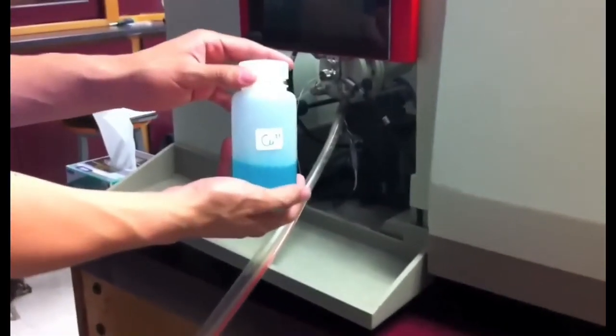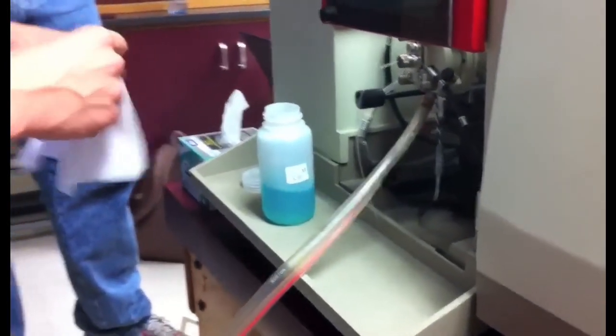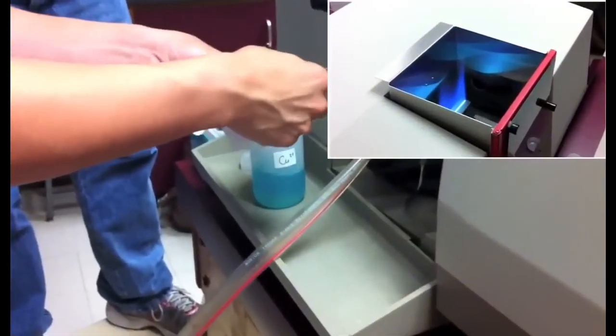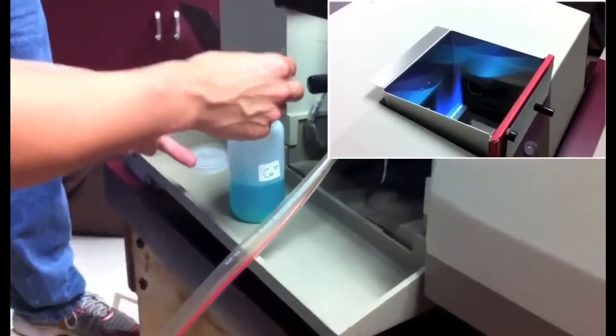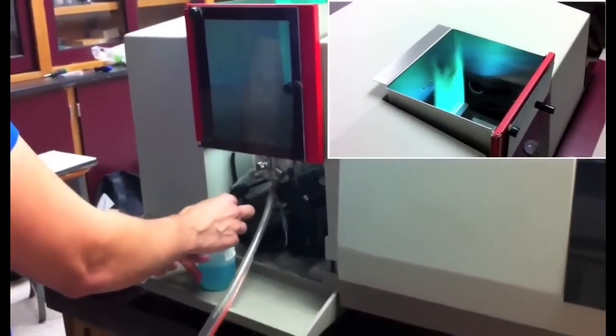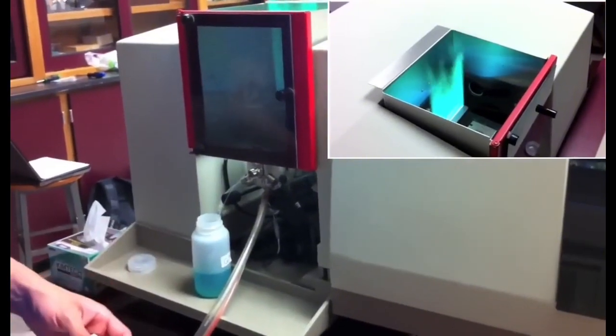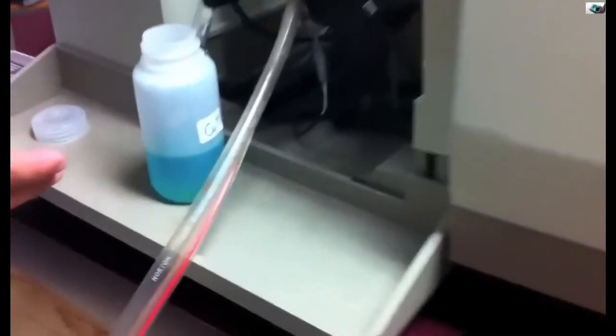This demonstration will use a sample of copper. First, start by cleaning the sample capillary with a chem wipe. Then, insert it back into the sample to be aerosolized, mixed with gases, and released into the flame. The flame turns a green color that is distinctive of copper. Waste is then siphoned off into a collection bucket.